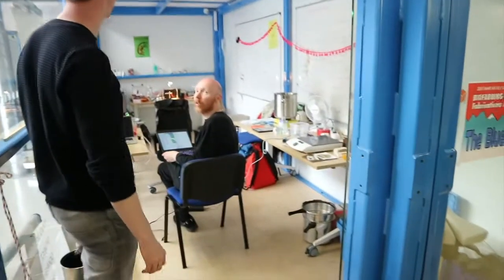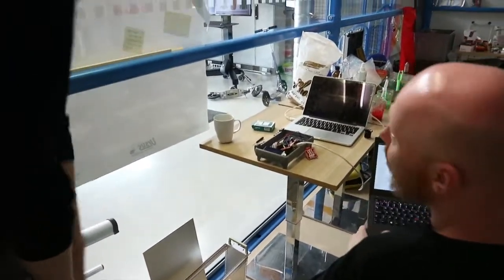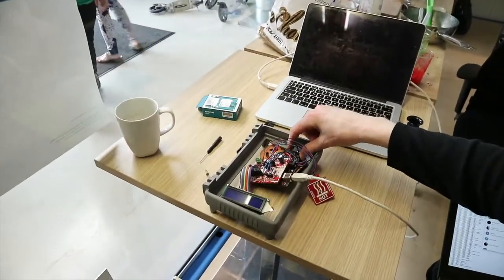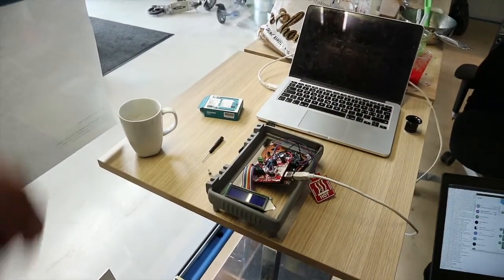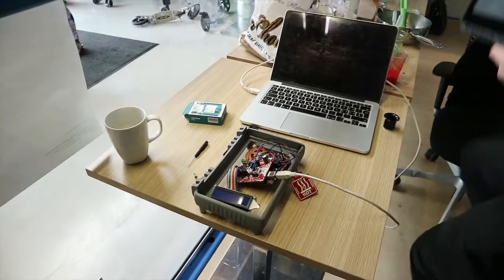What's happening here? PCR. Currently it's a pile of stuff inside. It is working, supposedly. You just need to put it in a box — it's a 3D printed holder for the tubes. Because what people have been doing before is milling it. Exactly.